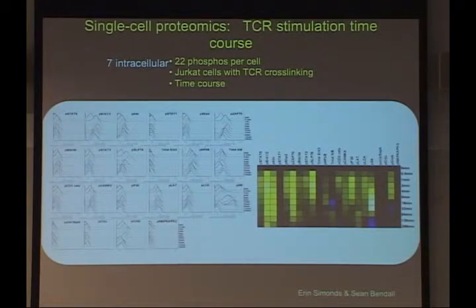I don't know what's happened with the T-cell signaling. I haven't done much with it lately, but it was a lot of fun to do at the beginning. And this is a figure that ended up in a lot of our lab's grant applications for CyTOF-related things. Basically, what I wanted to do here is take every T-cell signaling-related phosphorylation epitope in the lab and measure them in conjunction in a single experiment. So this is just a little time course that we did.